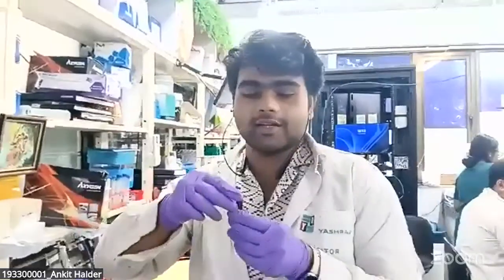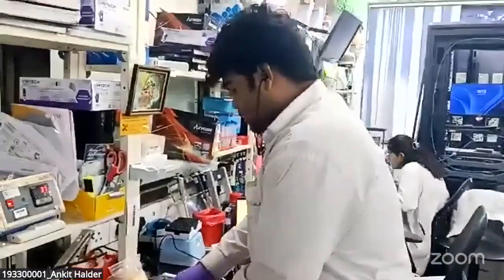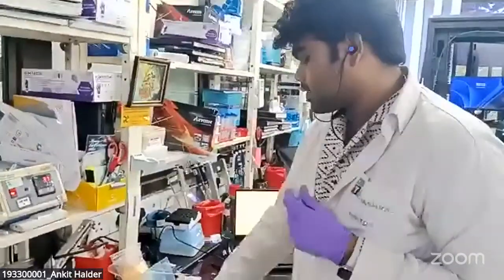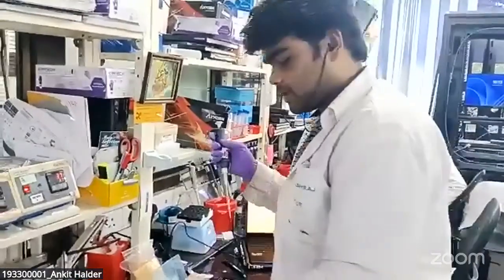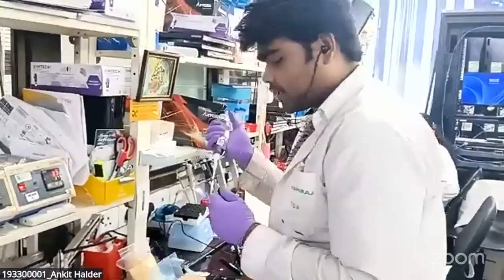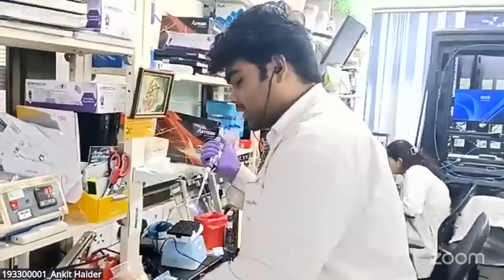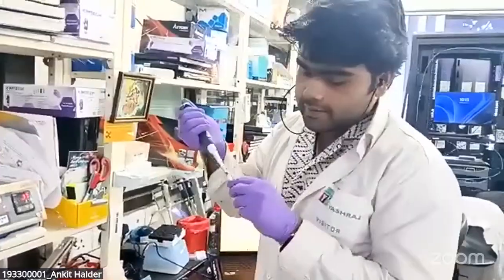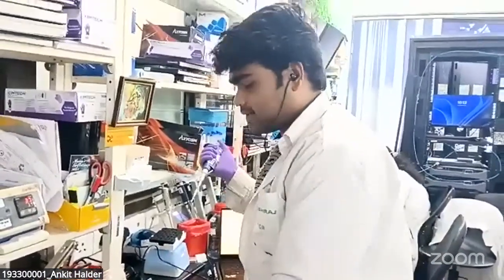IA is basically the compound that will prevent any kind of re-formation of disulfide bonds through alkylation. So right now, we will add the IA, and after that we will add the trypsin to start the first round of digestion. Here we are using a two-step digestion. We will add the trypsin in 2 times, and we will keep the solution at 37 degrees Celsius.